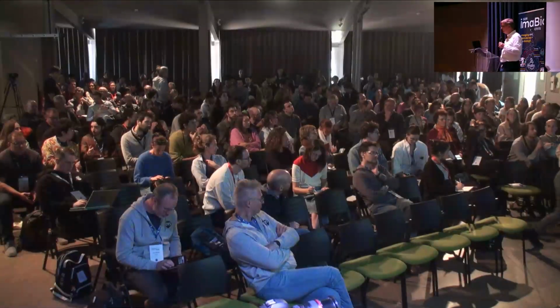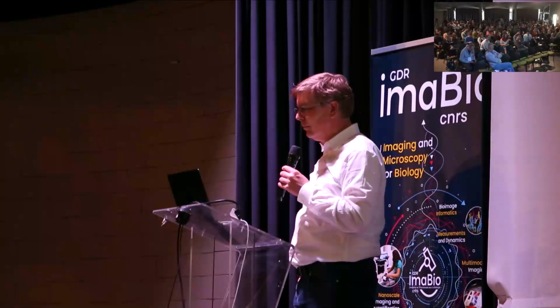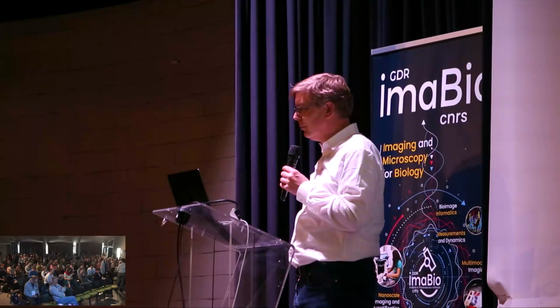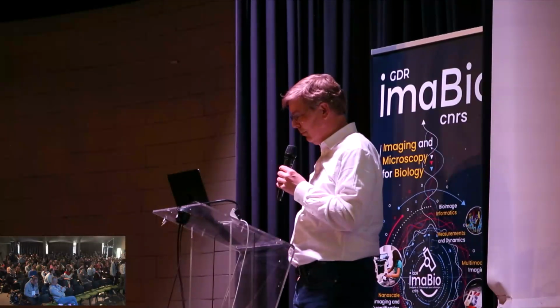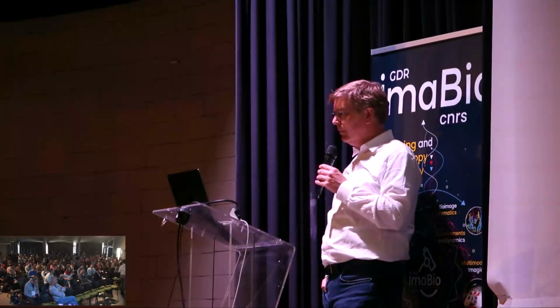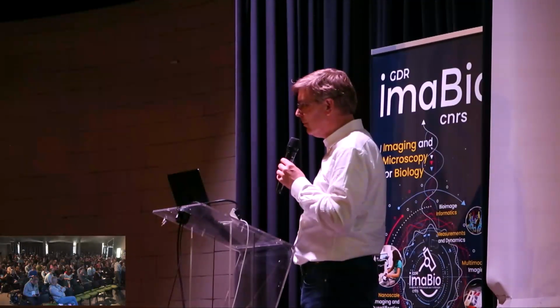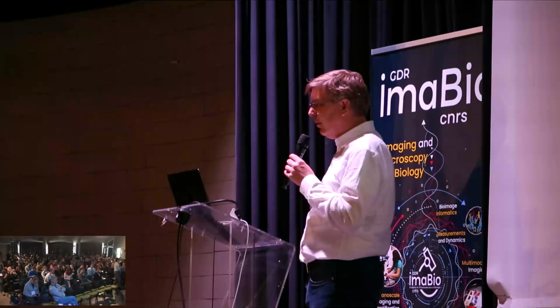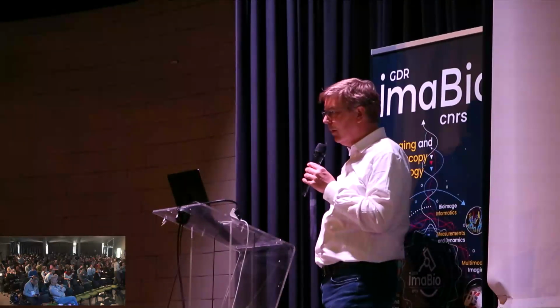Thank you. I have a question about your resolution. You mentioned 25 nanometer resolution. Are you trying to reduce the size of your targeting objects, because you use antibody, nanobody, then DNA strand, which I think in total would be like 15 or 20 nanometers? So basically your dye is quite far from your target. Are you trying to optimize this or to reduce all those objects?